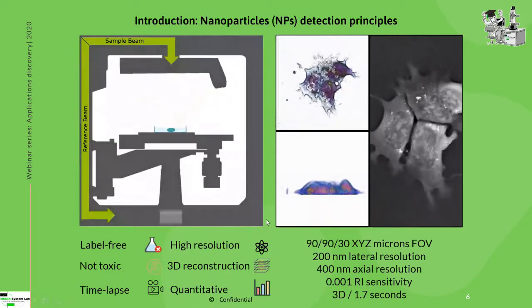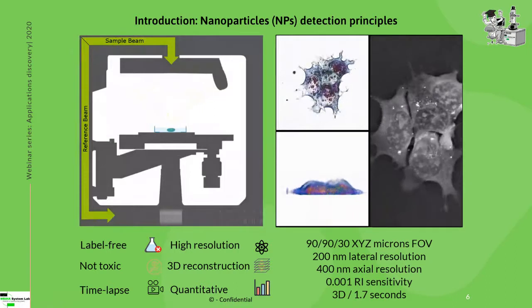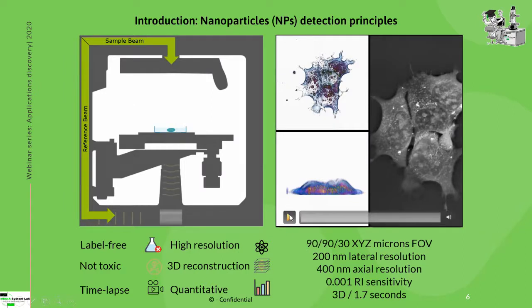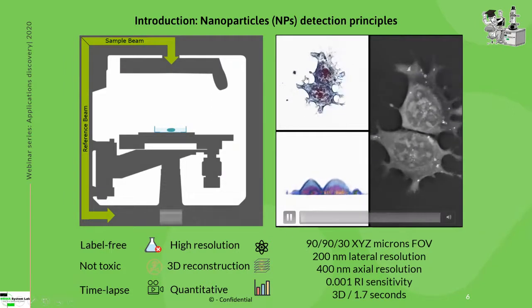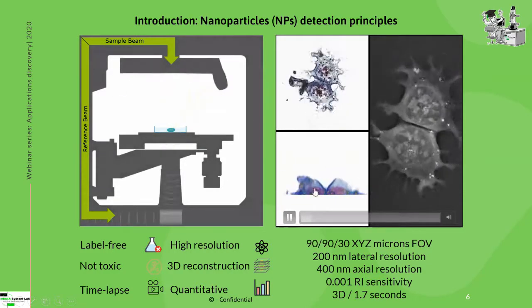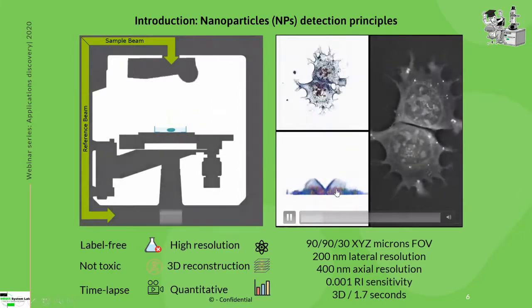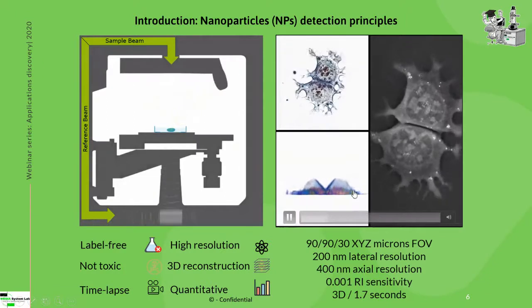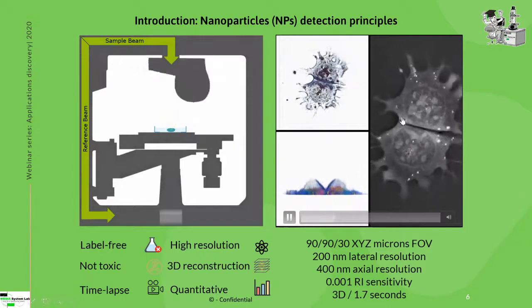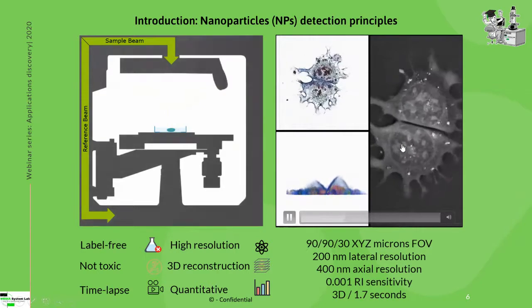The holograms are taken by a camera, and then an algorithm computes back what was the object creating the perturbation. In this way, you can get a reconstruction that is not only 2-dimensional but also 3-dimensional. In this case, you see a reconstruction based on cellular color, following the optical density of the cell. And in this case, you have a grayscale representation of refractive index that shows you the stem cells growing on the stage of the microscope.